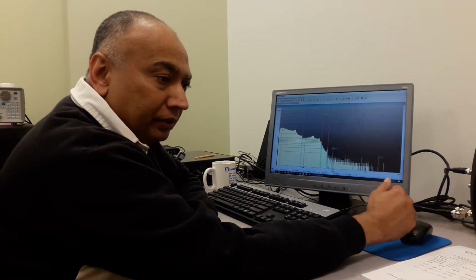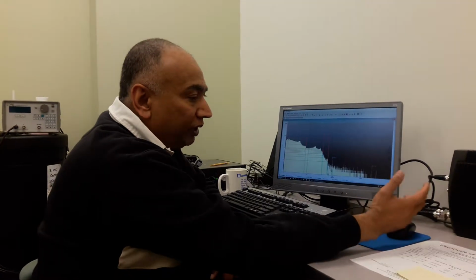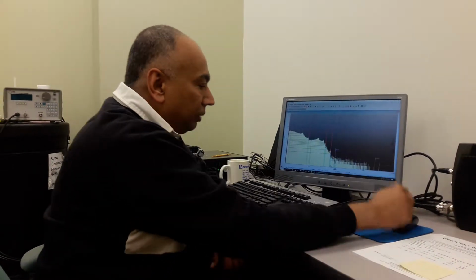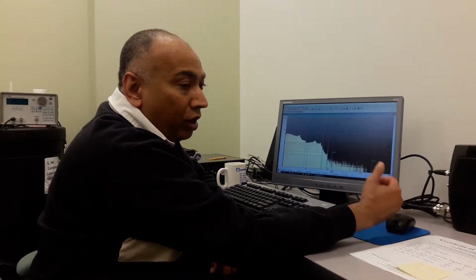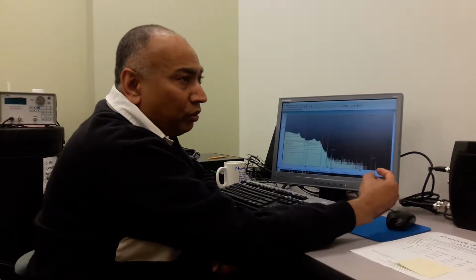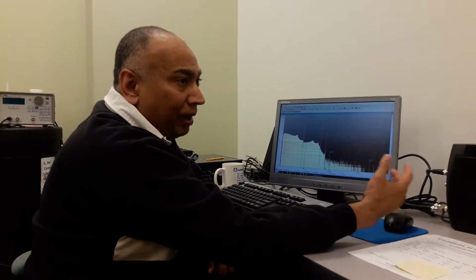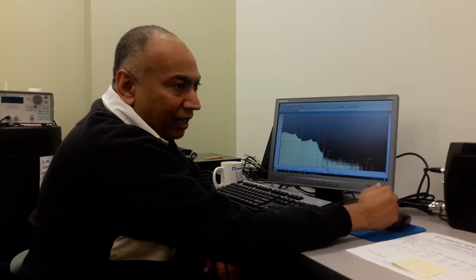Okay, in the last section of our work, we showed you how to do an energy calibration and a full width half maximum or a shape calibration after we did a peak processing and peak locate. And now in order for us to do a quantitative analysis, that means to not only identify the radionuclides but also to calculate the approximate activities of my samples, which is almost the primary location of most applications, I will have to do an efficiency calibration.